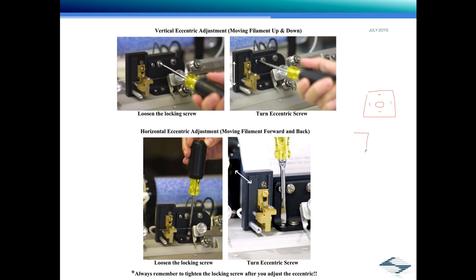With a trough filament, you want it actually just sitting a little bit low. So here's your trough filament. You want it kind of low in the trough filament because you're not getting as much heat up here. So you've got to have it sitting down a little lower.